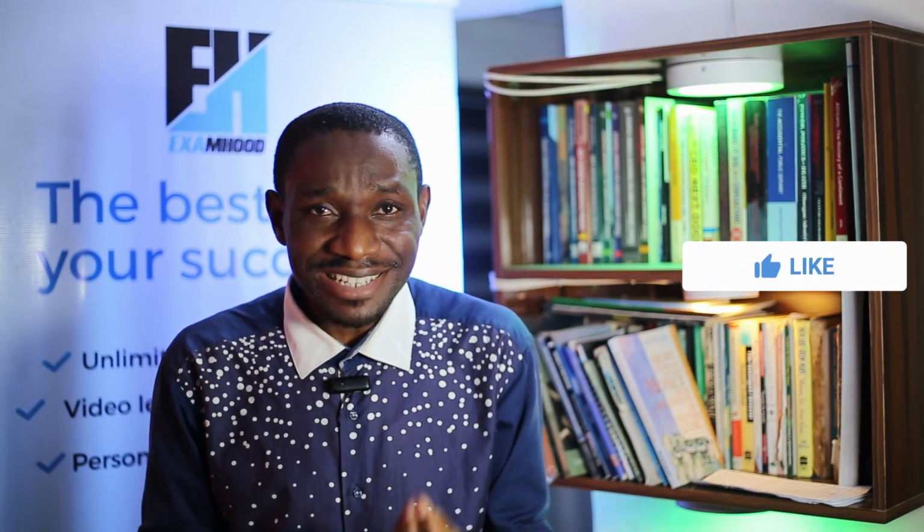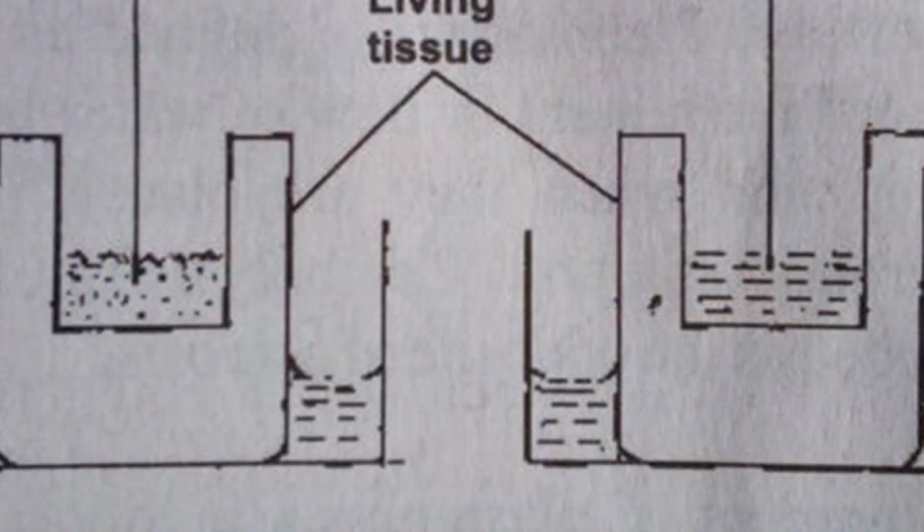So there will be a rise in the level of sugar solution in setup A, while in setup B, the level of water will remain the same. That tells you that osmosis has taken place in setup A, while in setup B, there was no osmosis. You understand? There's no osmosis in setup B because there's no difference in concentration. The two solvents there, the water inside the cavity and the water in the petri dish, are the same. So there will be no movement of water molecules.